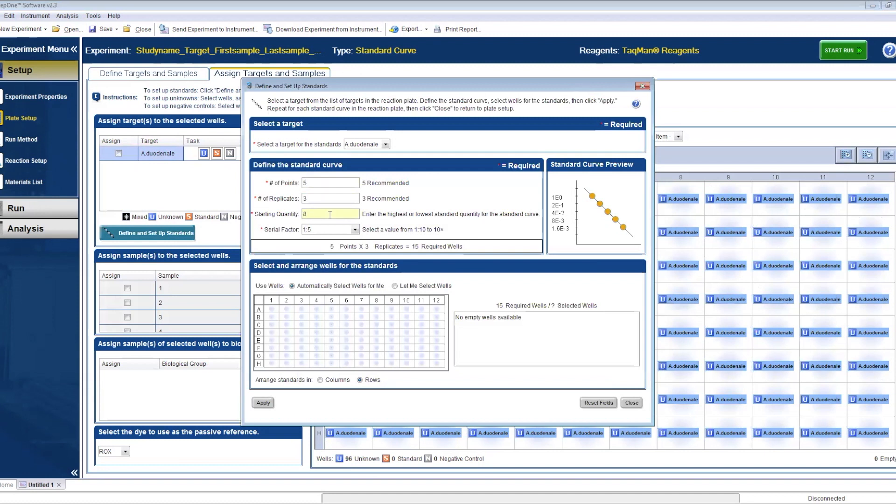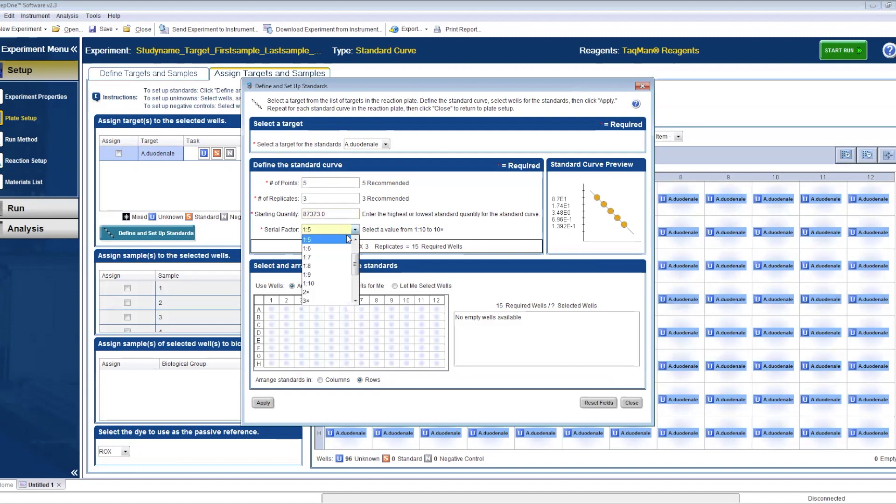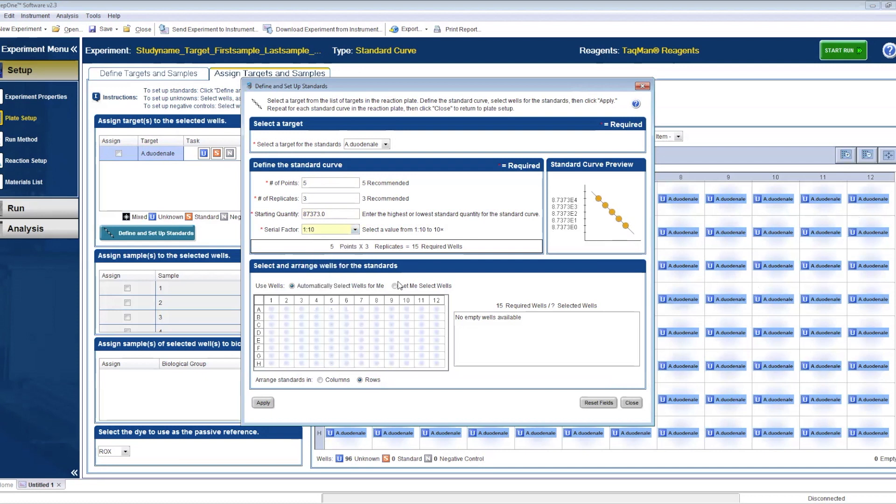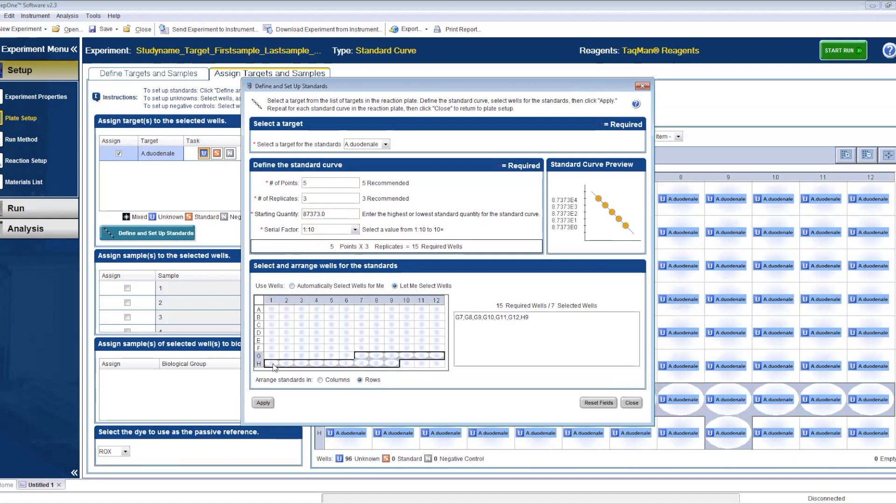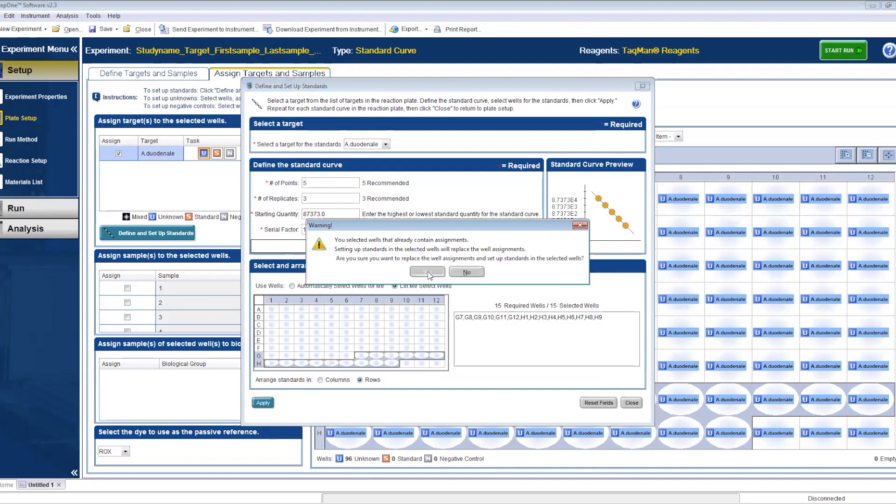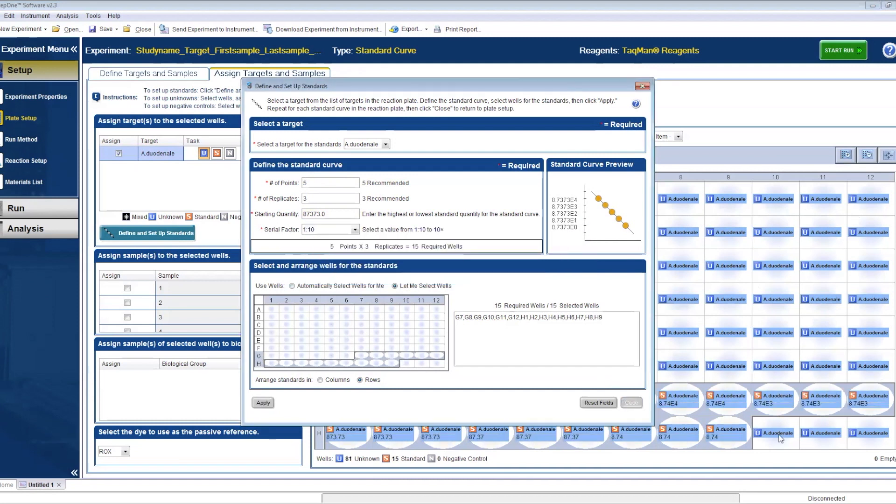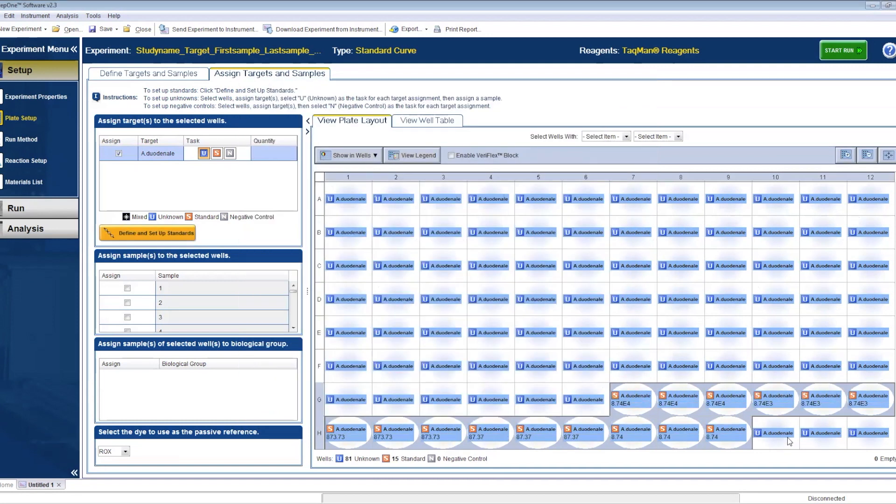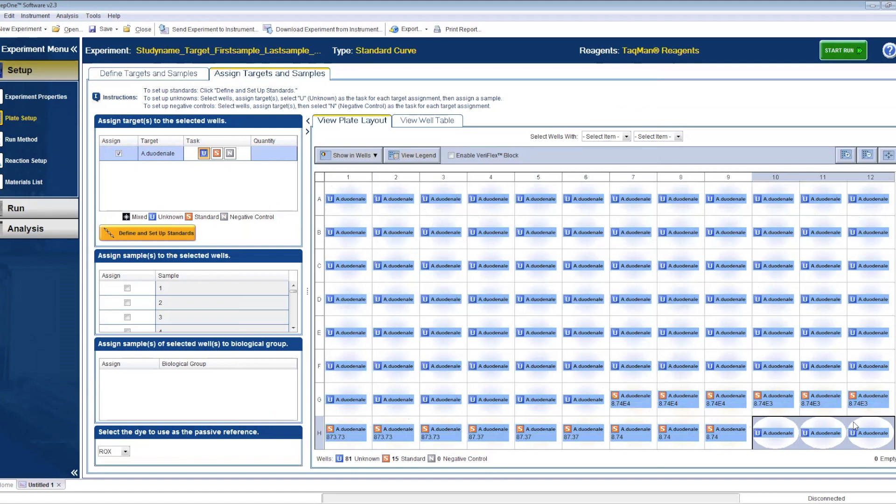Click on the button saying define your standards, leave the number of points as 5, the number of replicates as 3, add the right starting quantity based on STH specific amplification calculations from the SOP and change the serial factor to 1 to 10. Then click on let me select wells and highlight the wells G7 to H9 and click apply. Click yes and then close. The software will automatically select the standards and adjust the quantity for you.